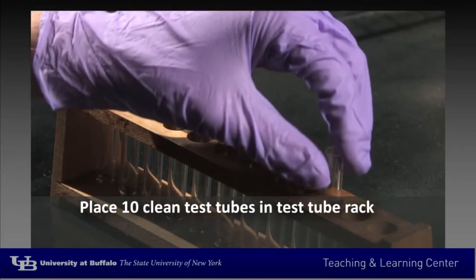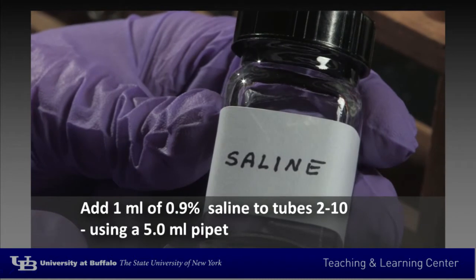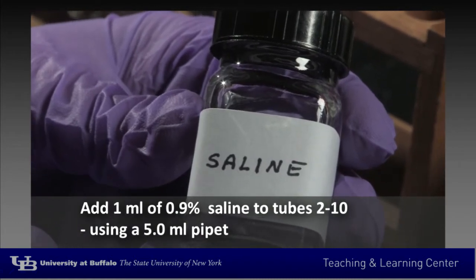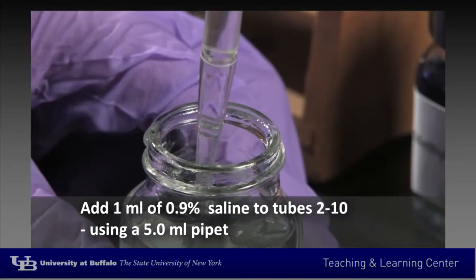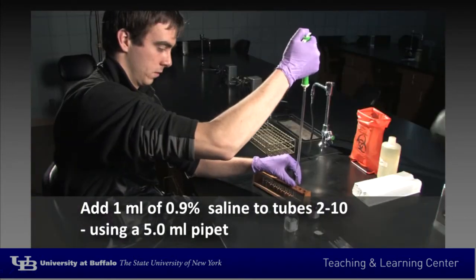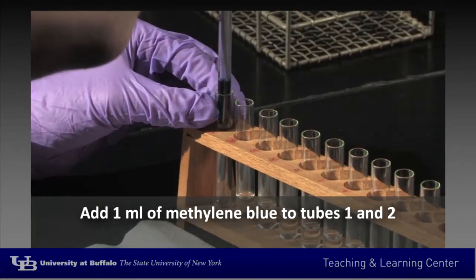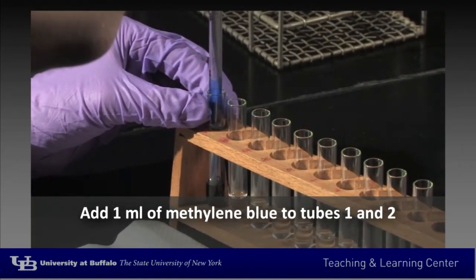Place 10 clean test tubes in a test tube rack. Add 1 ml of 0.9% saline to tubes 2 through 10 using a 5 ml pipette. Add 1 ml of methylene blue to tubes 1 and 2.